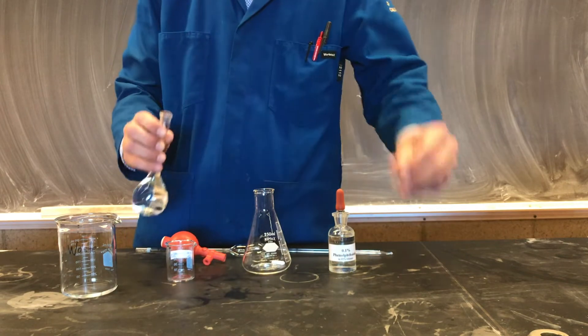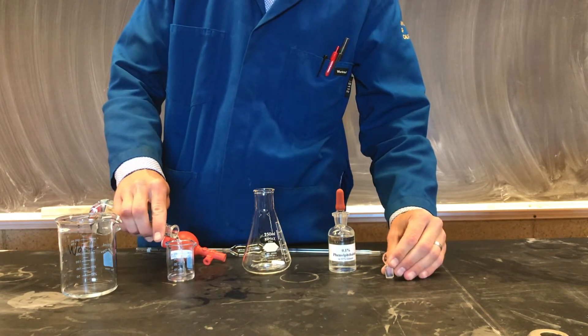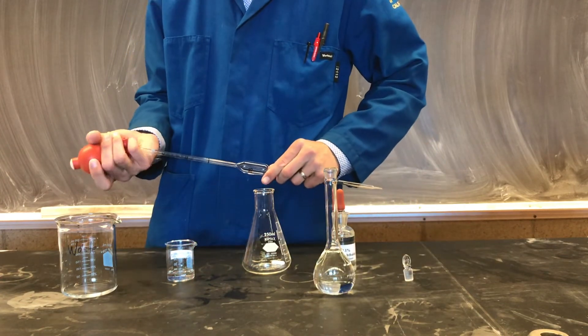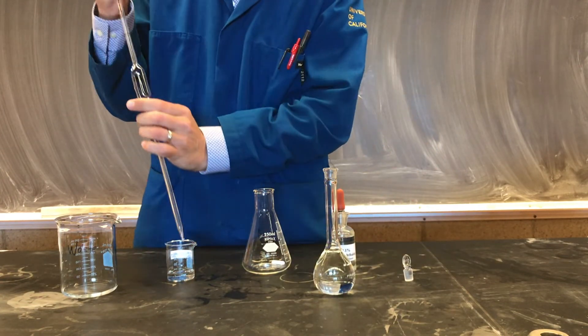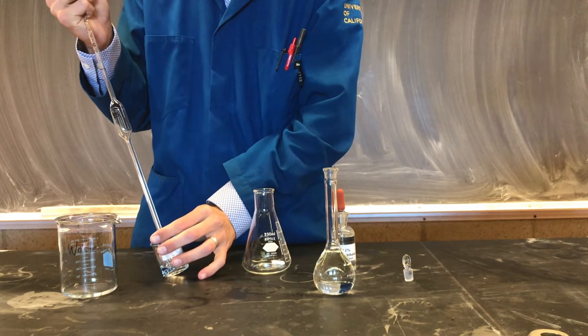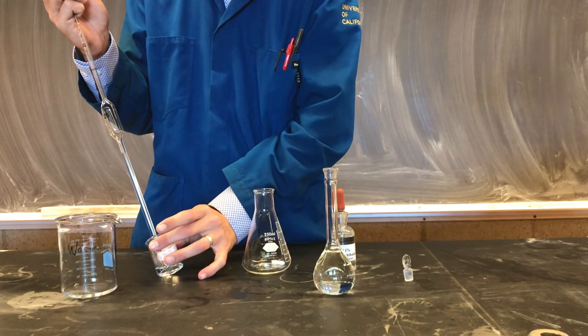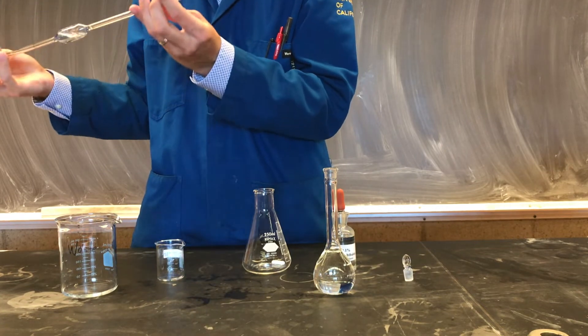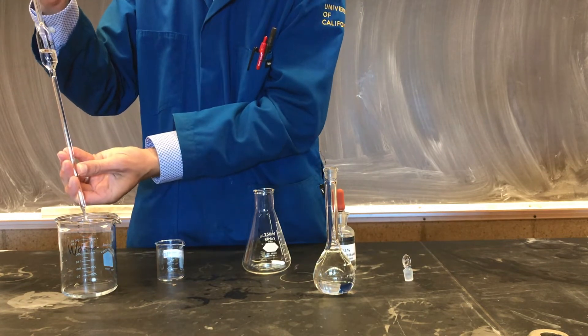We're now ready to prepare a sample for titration. To do so, we're going to use a 25 mL volumetric pipette. Again, we're going to condition our glassware to ensure constant concentration of solution and the removal of any impurities from our equipment. We'll roll the solution inside the glassware and dispense.